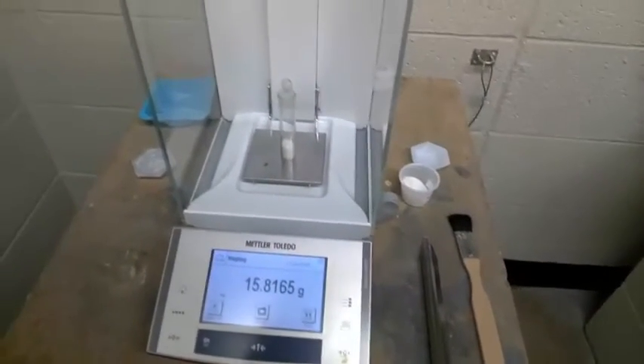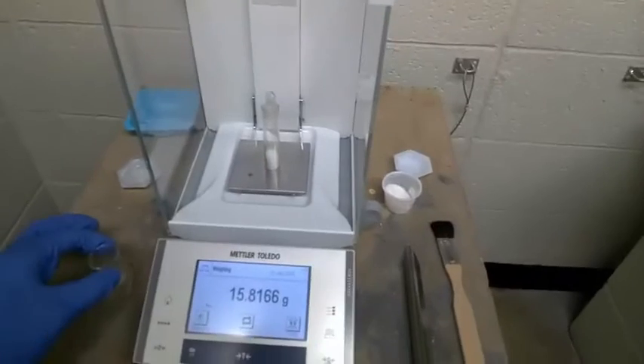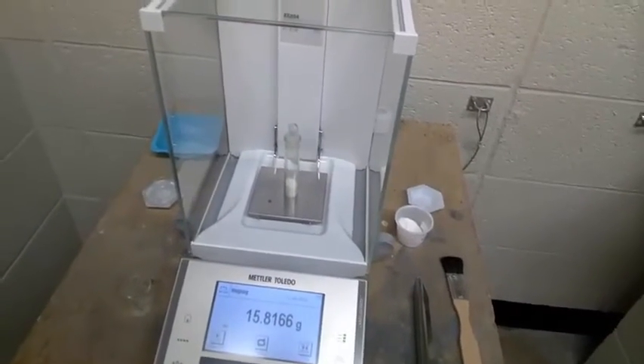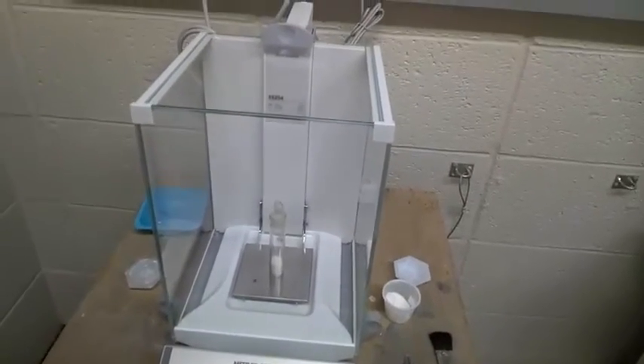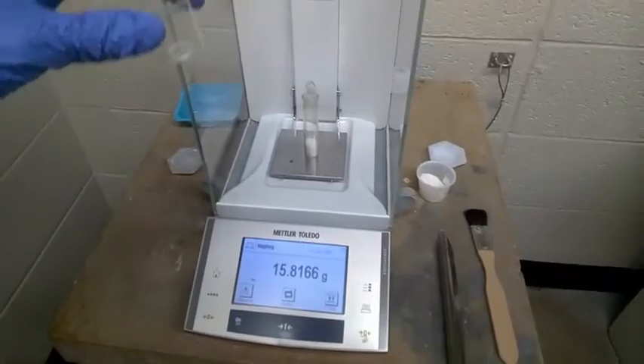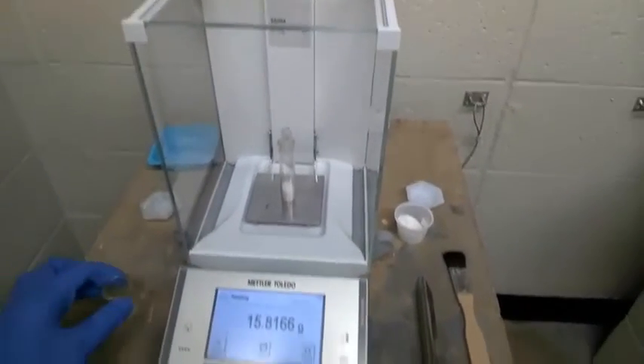For this case we'll call it good. Weighing by difference has several advantages in that because the weigh bottle has a lid, it keeps additional wind currents down and it allows you to dispense directly into the vessel that you are interested in using.